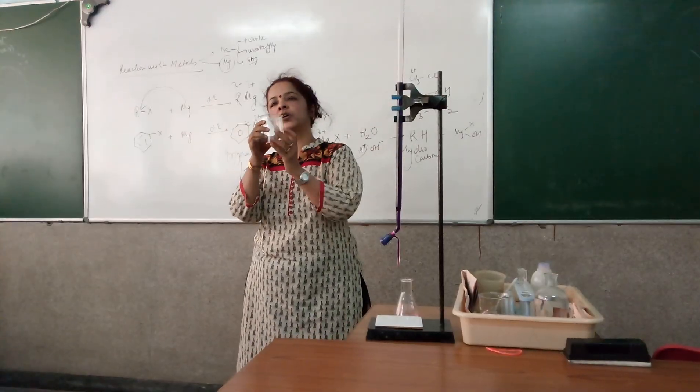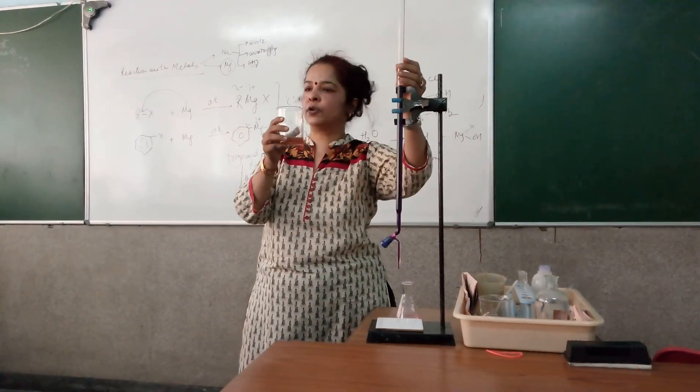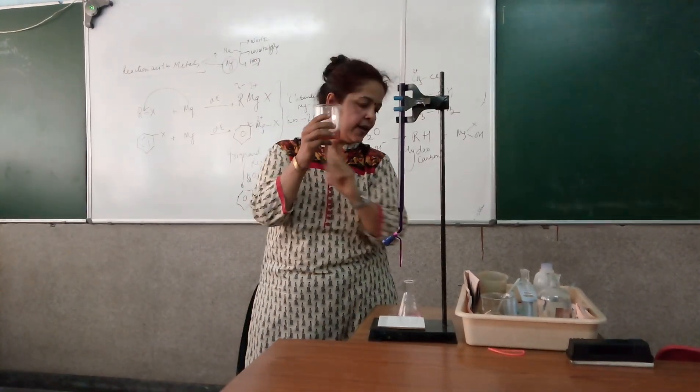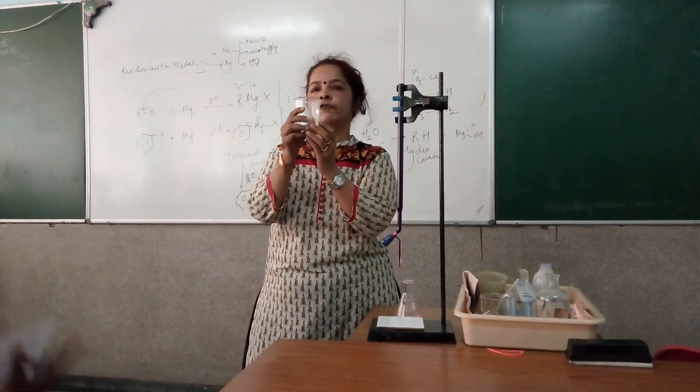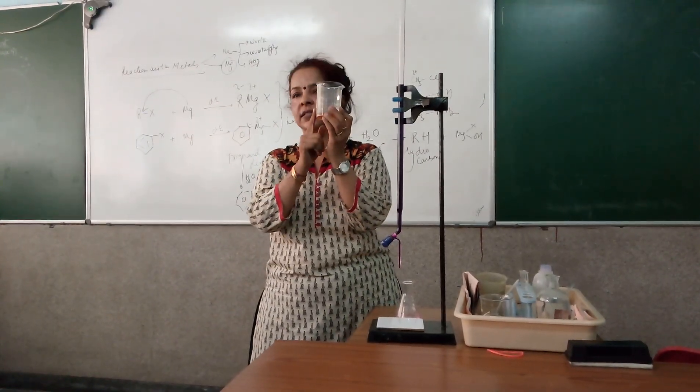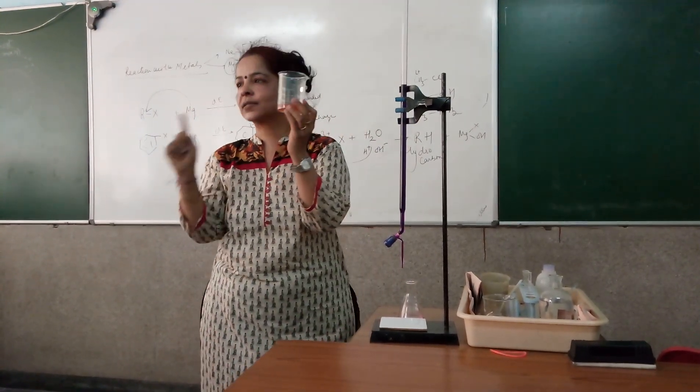I had rinsed my apparatus with water and put the water in it. Then I had rinsed my burette with KMnO4 and added KMnO4 to it. Finally, I had rinsed the pipette with Mohr's salt and added it. This means this solution contains water, KMnO4, and Mohr's salt — no acid.